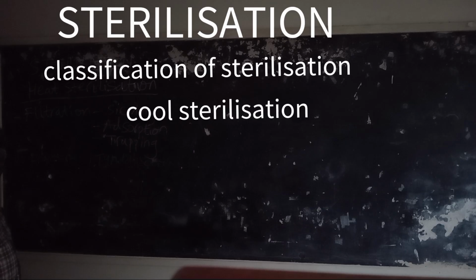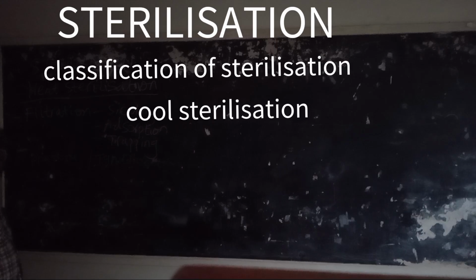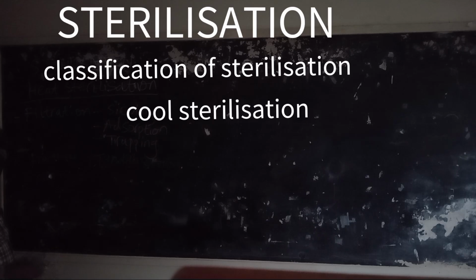Then finally, we have cold sterilization. This involves the use of chemicals at a low temperature. We sterilize at a low temperature when the media need sterilization but are sensitive to high temperatures.